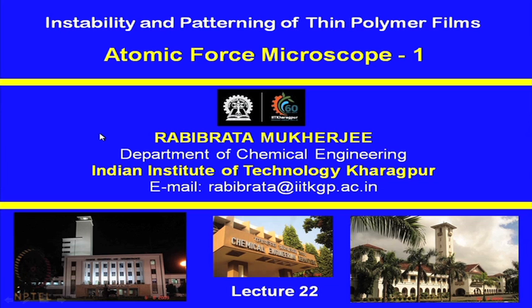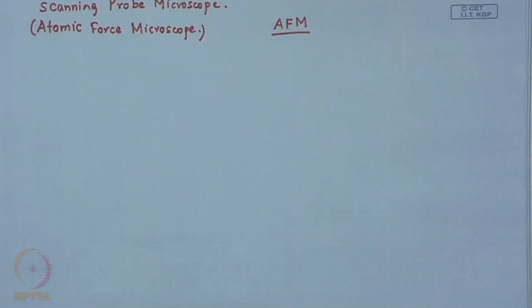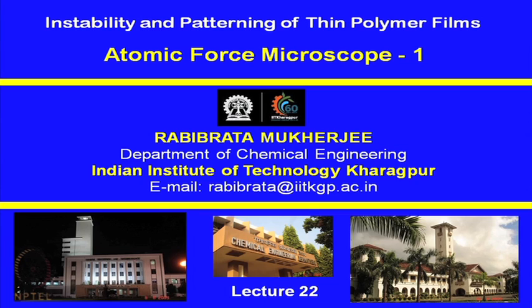Welcome back. We now change gears a little bit and start talking of something slightly different. As you can see from the title of the lecture itself, we are now going to talk about the atomic force microscope. I do not know how many of you are aware of this name, the atomic force microscope, or the AFM as it is commonly known.